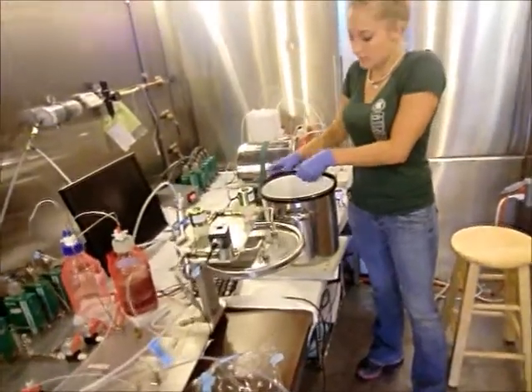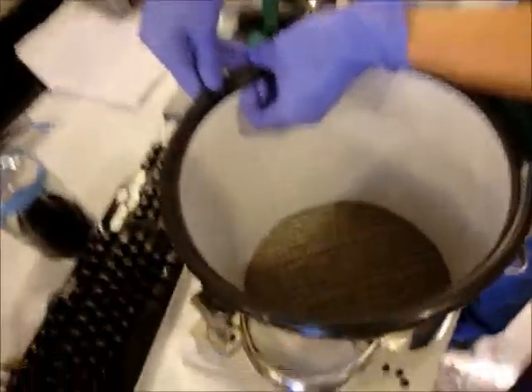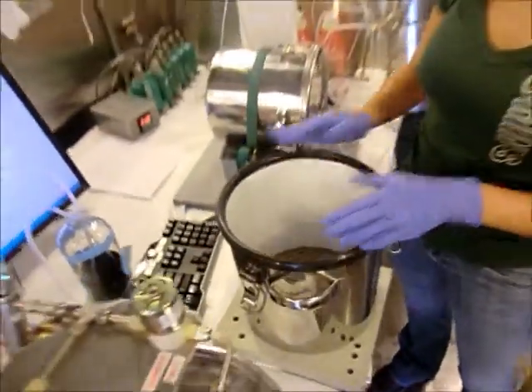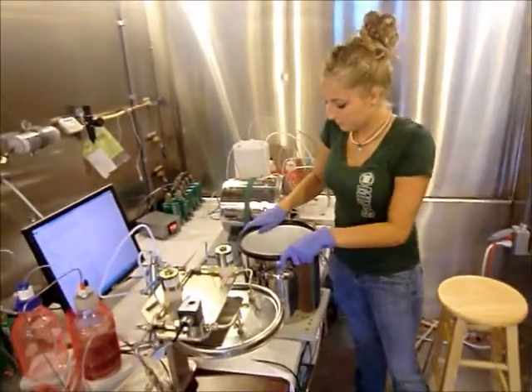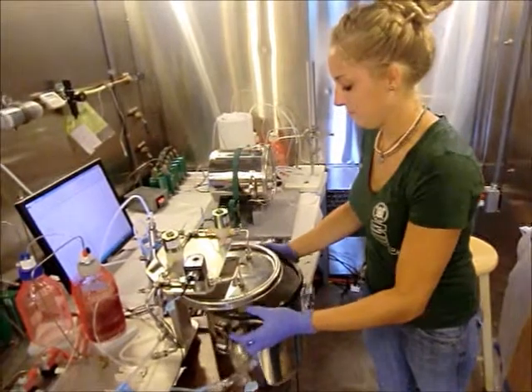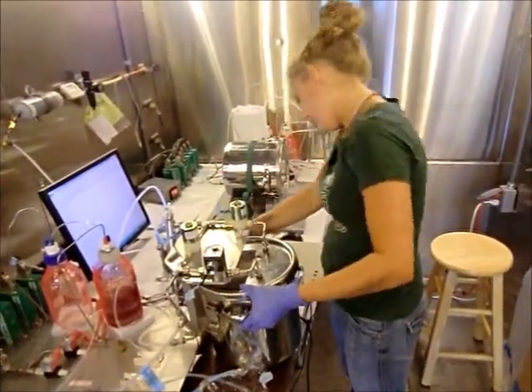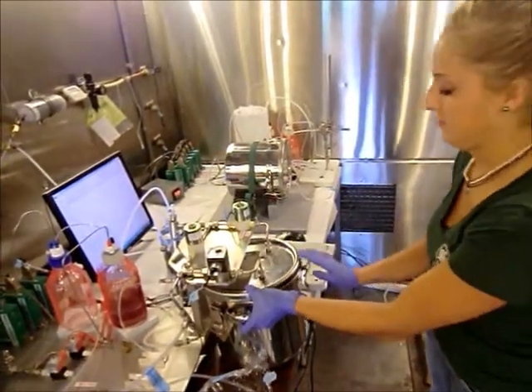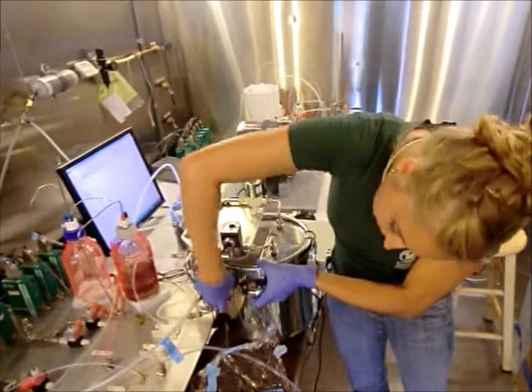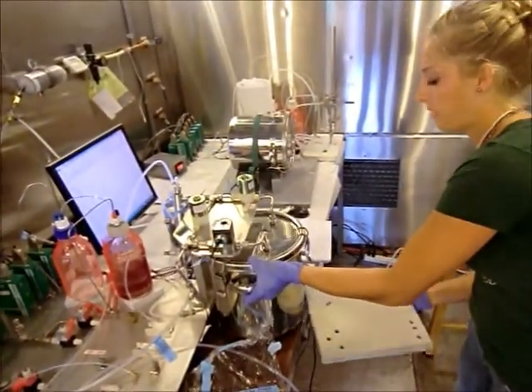Then I put the rubber seal around to double check that it's going to seal properly when I close the system back up. I put the clamps back on, and put the block back under.